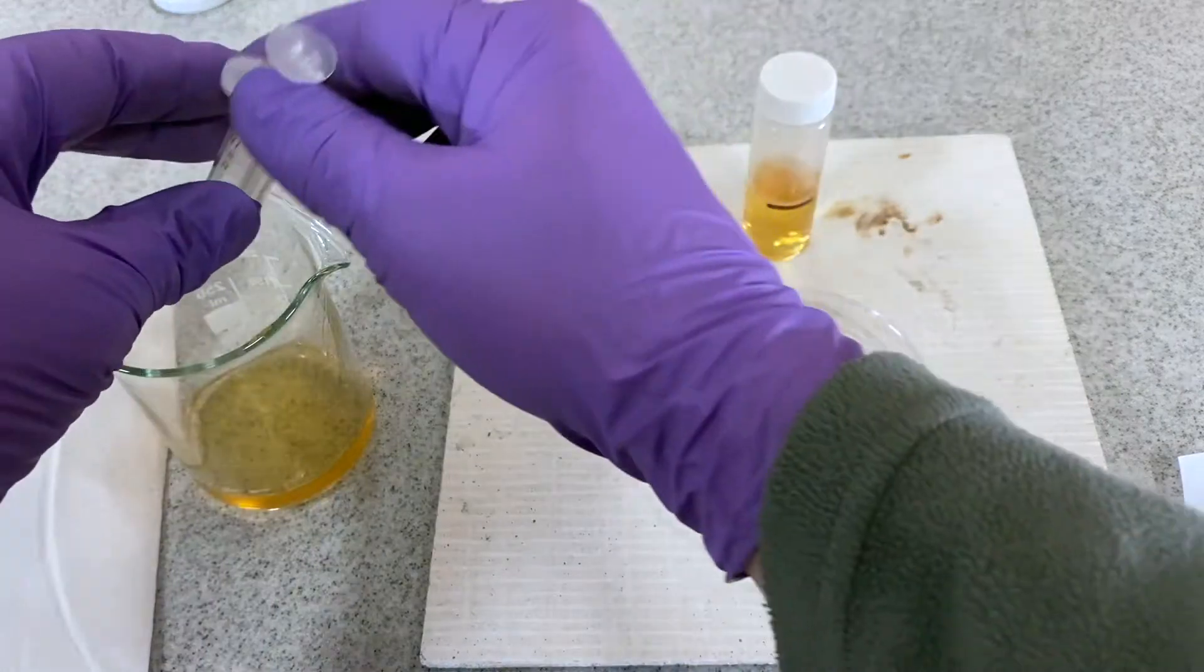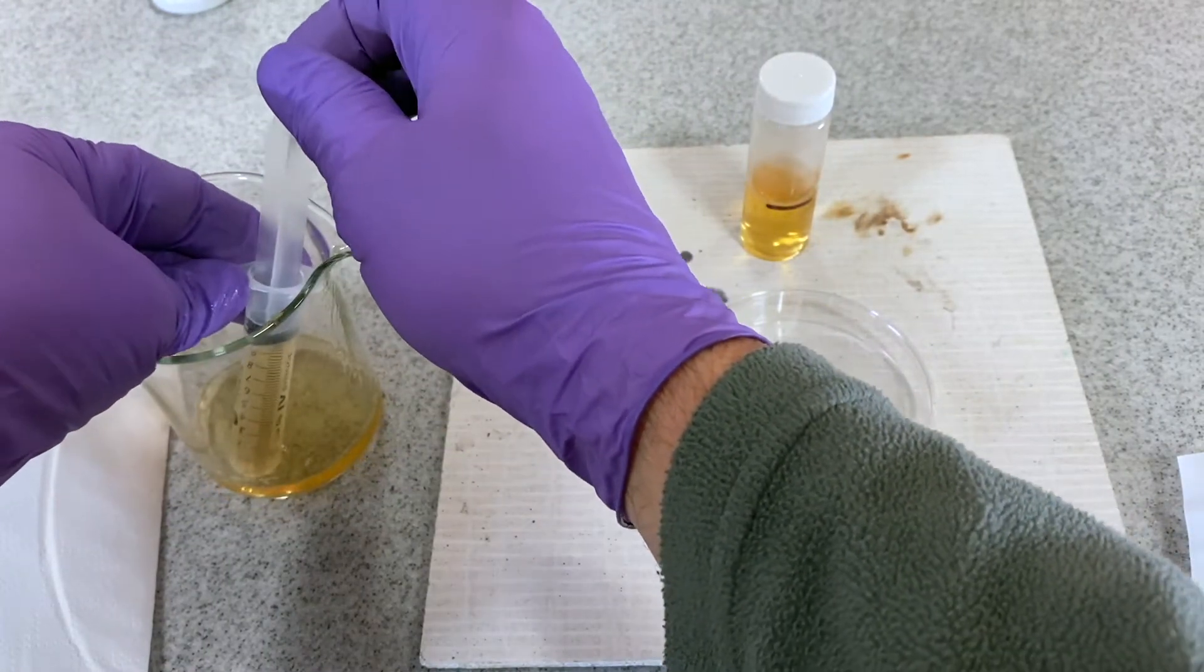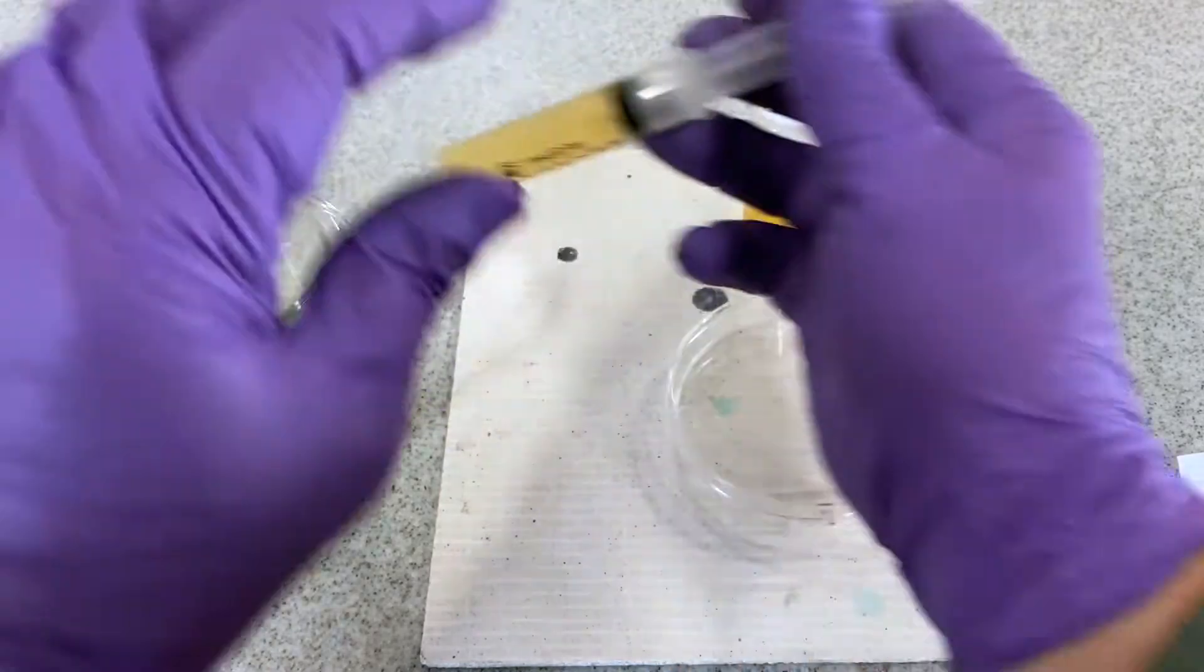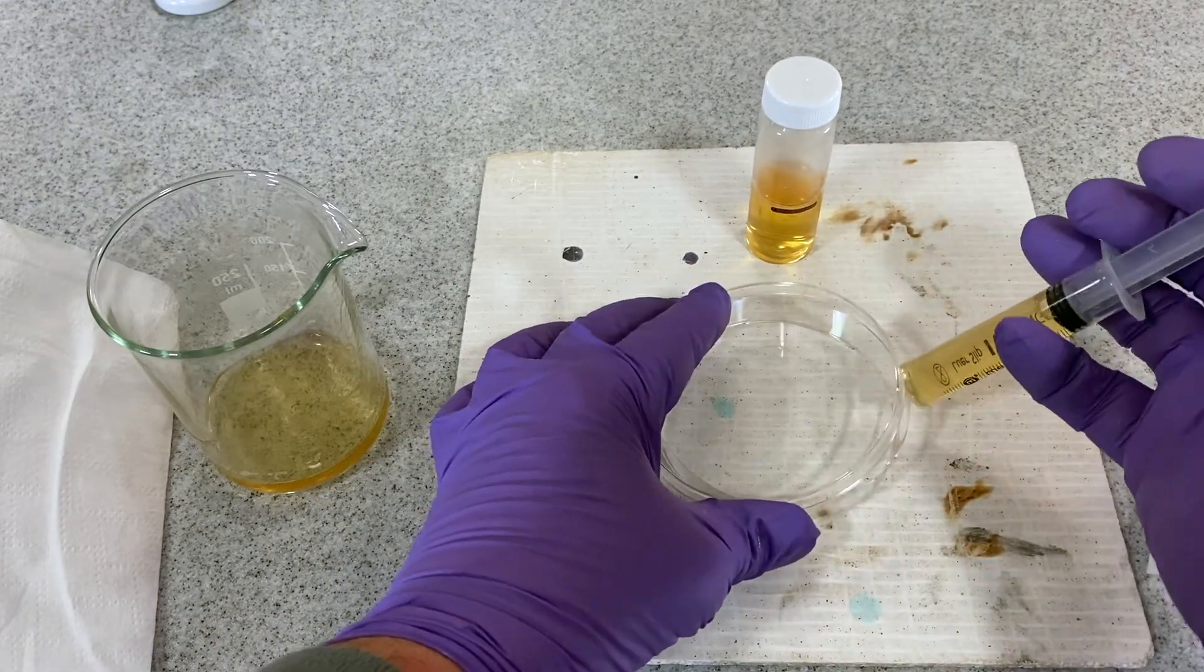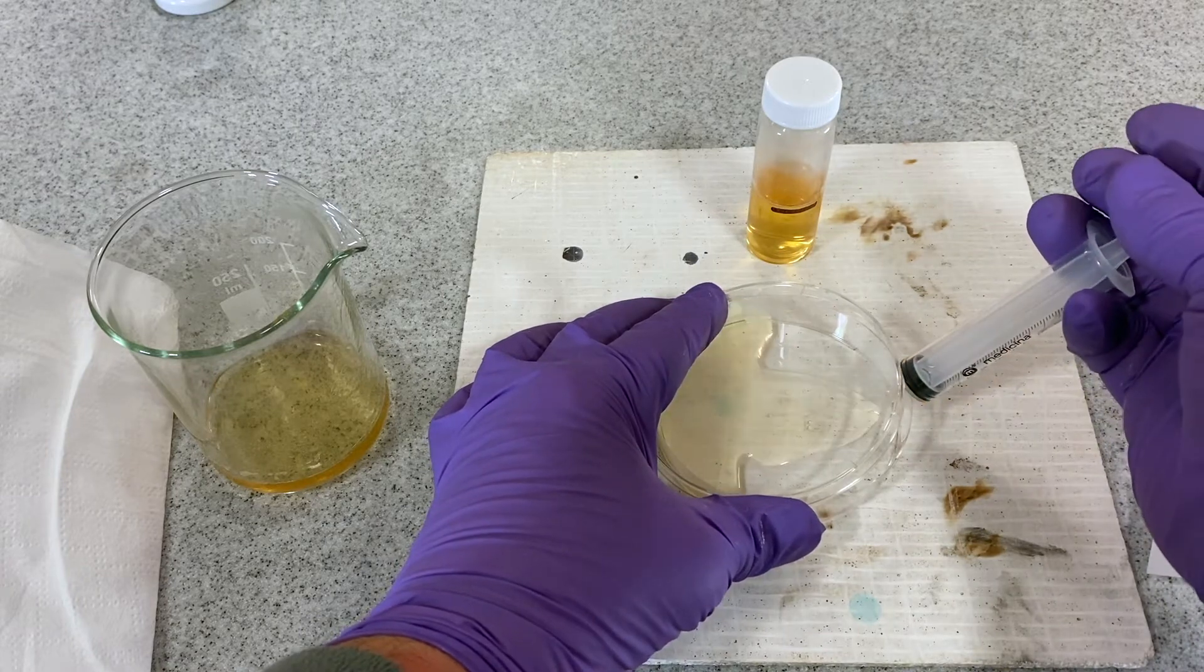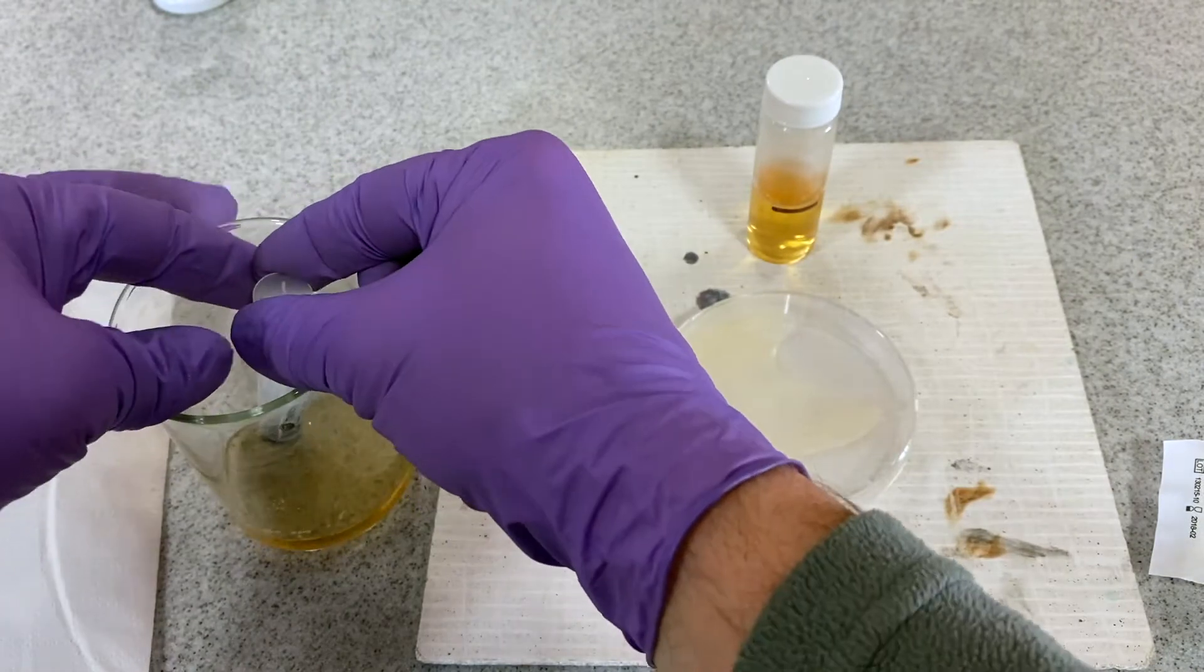When transferring the agar medium into a petri dish, it's much more efficient to use a 10ml syringe. This allows the plate to be filled without removing the lid completely, thus avoiding cross-contamination. The technique used is to slide the lid slightly to one side.